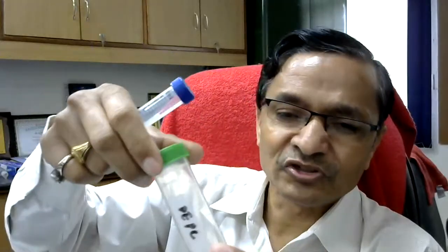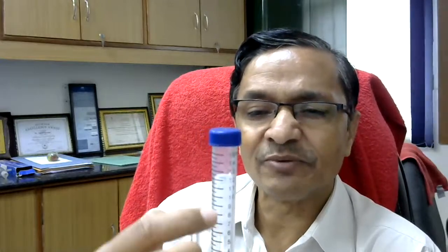Okay. Then there are different types of tubes again. So screw cap tubes, you can see this one. This is 50 ml tubes. This is still thinner, 15 ml tubes. So depending on the experiments or requirements, and then labeling is there, marking is there. So roughly you can see how much solution. Suppose 5 ml solution you have to take. So you can see the 5 ml marking, and then final marking is also made. So accordingly you can roughly take the solution in this based on this marking.